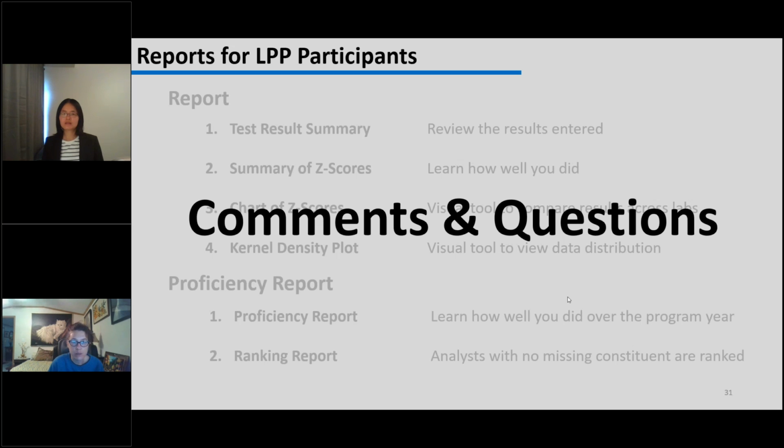When the REL limit of reproducibility is above 100%, can you still use this result in your validation work? Can you repeat the question? It is when the REL limit of reproducibility is above 100%, can you still use this result in your validation work? I would recommend cautious use of that result.